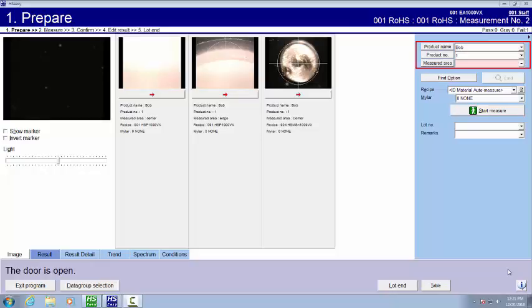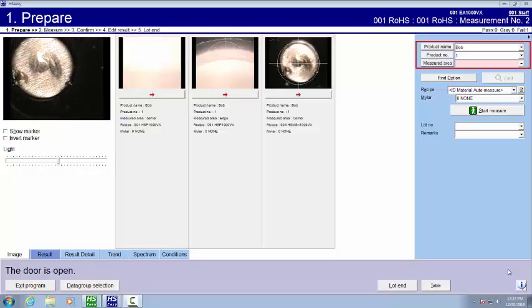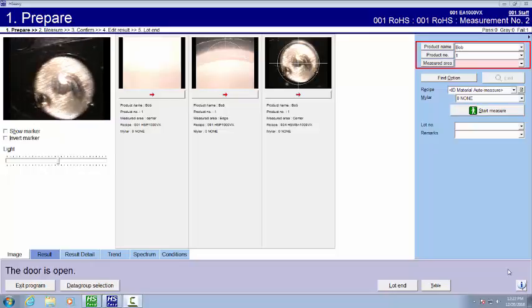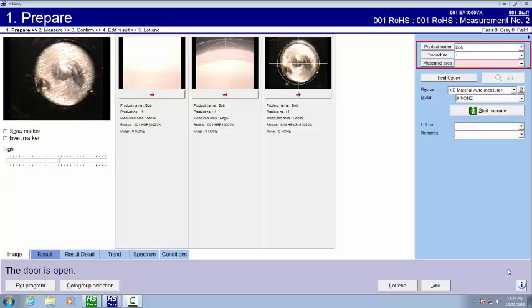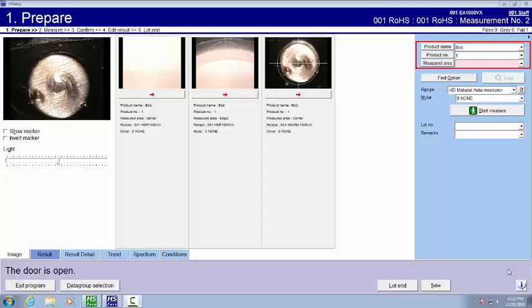I have a solder sample in my hand. I'm going to place it on the image screen. Notice in the upper left hand corner as I place my sample, there we go, there's my solder sample.